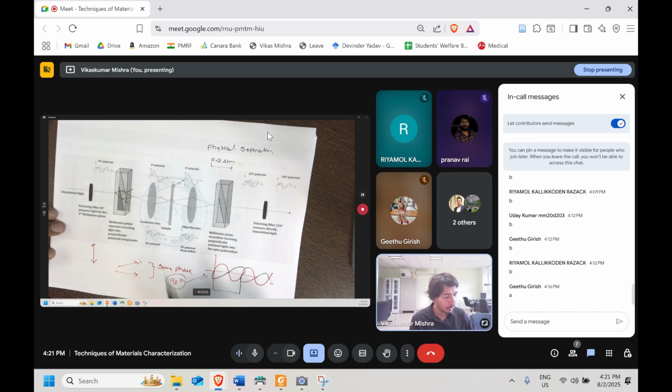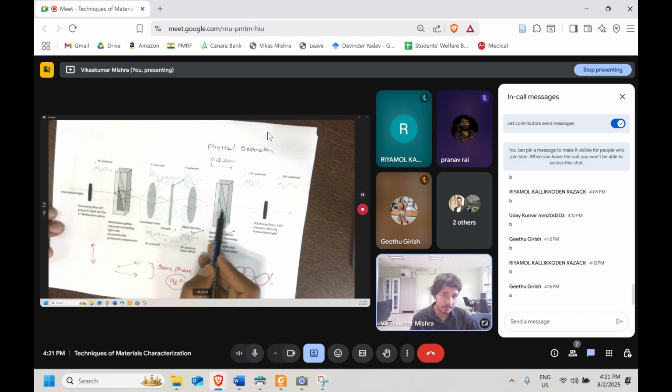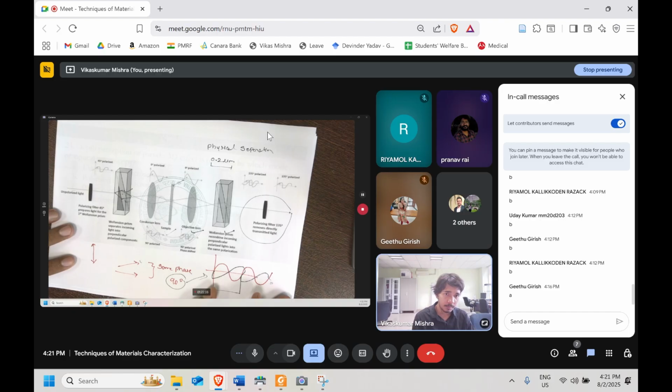So here, after that, it is the condenser lens. Once it interacts with the specimen, there is the objective lens. After that, again one more Nomarski prism is there, which is going to converge them together. And after that the polarizer will be there, and after that a screen.